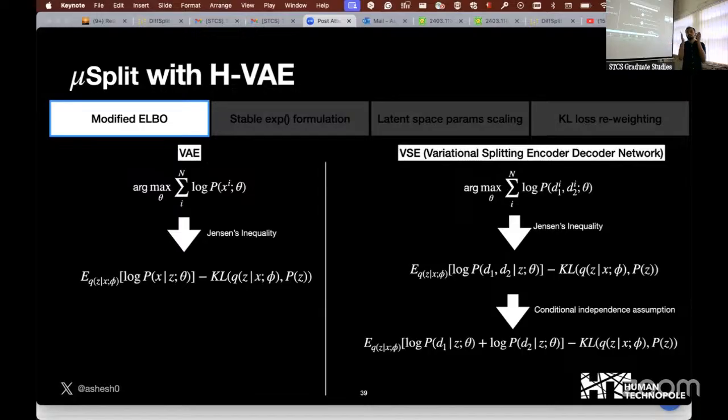So now it is not an autoencoder because you have 1 channel input and 2 channel outputs, right? And the input is a superposition of 2 structures. Those 2 structures are the 2 targets. So you have some label data where you already know what the 2 things are. Yes. So you probably need a lot of that for training, right? A lot of data in this format. So how do you get that?